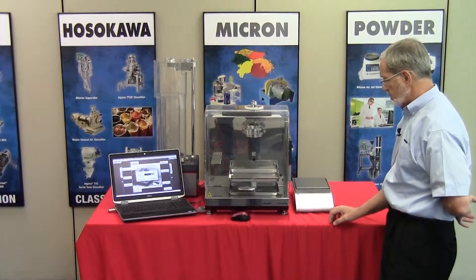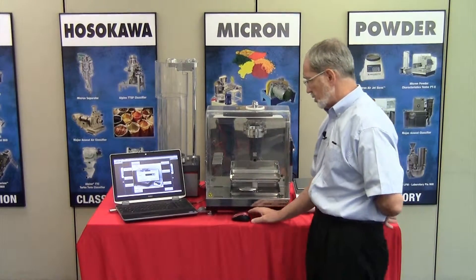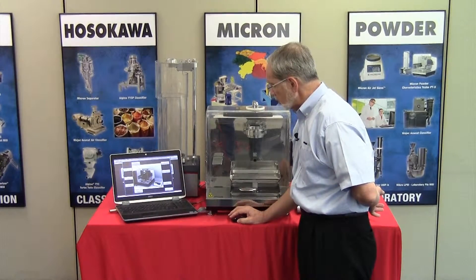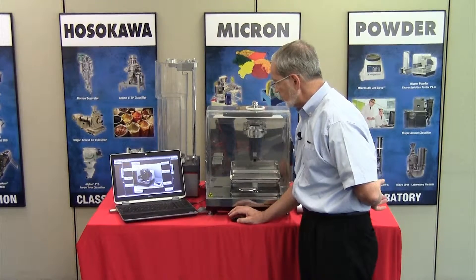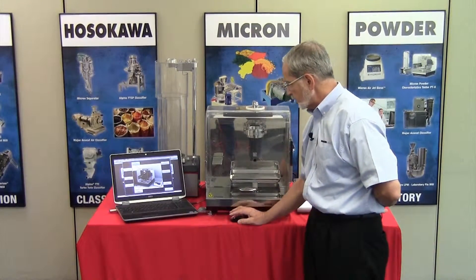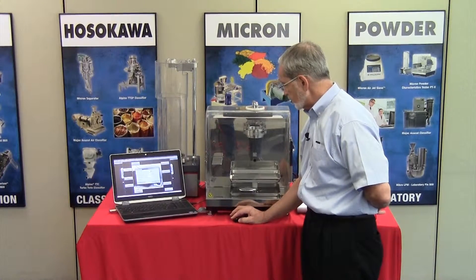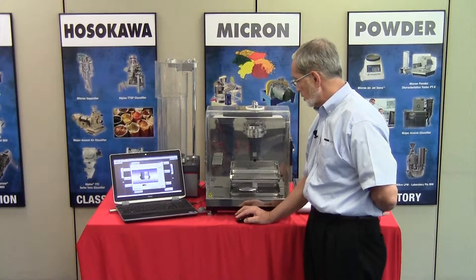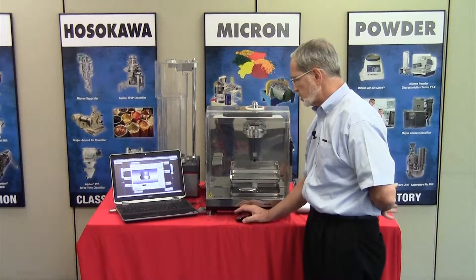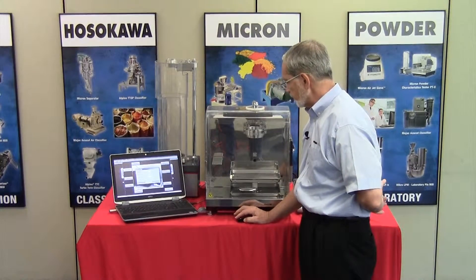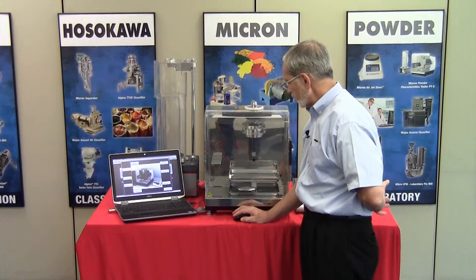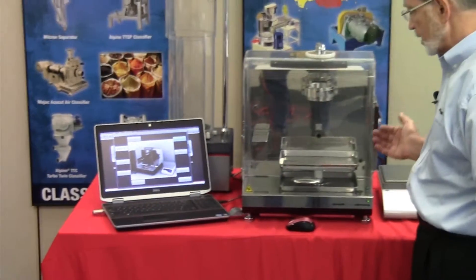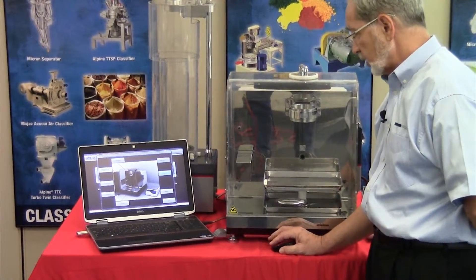When it turns blue you have communication. I can tear the balance here and also tear it from there. This particular component is an optional component that's applied independently. Vibration — we can actually vibrate this; I've got a little tool in here just to give you an idea because it's going to vibrate. As you can hear, it gets rather noisy, so we'll stop it midstream just to confirm that vibration is working. Start, idle, run — we can flash the lights, which confirms communication. And then there are the various sensor settings.